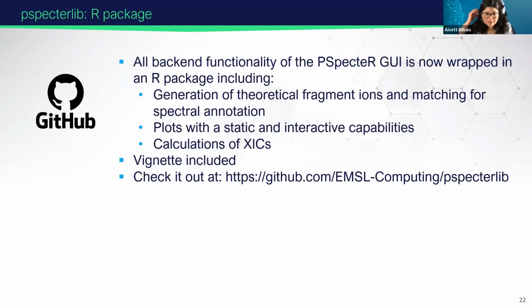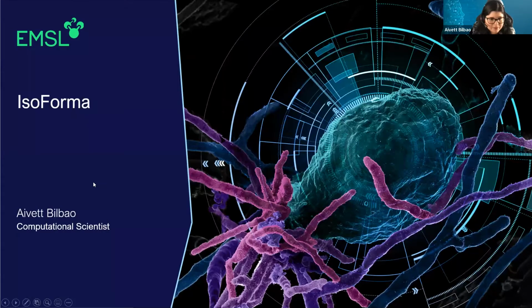Thank you, David. Hello, everyone. Thank you for joining us today. As Mowei and David mentioned, I will focus in this last part on talking about Isoforma.